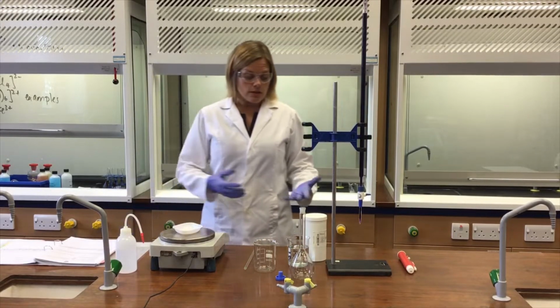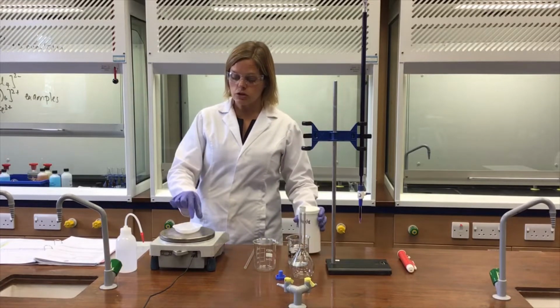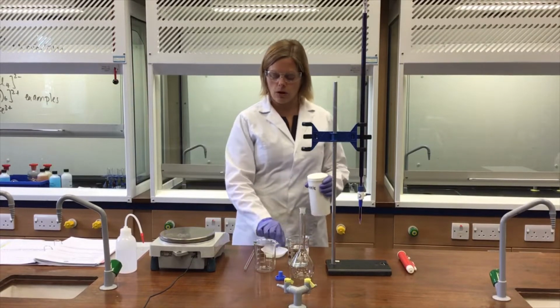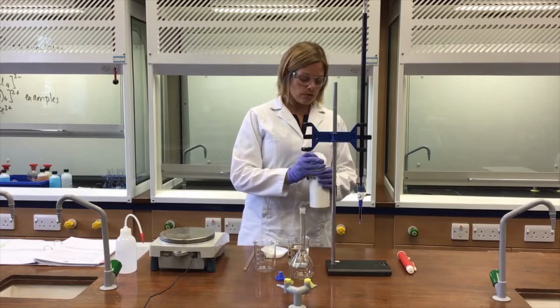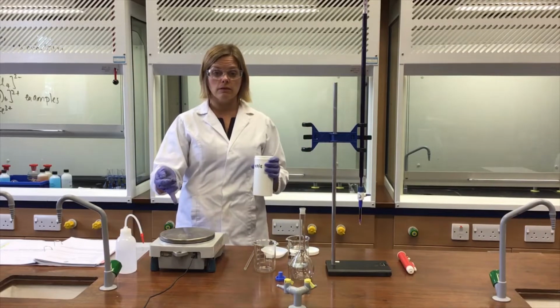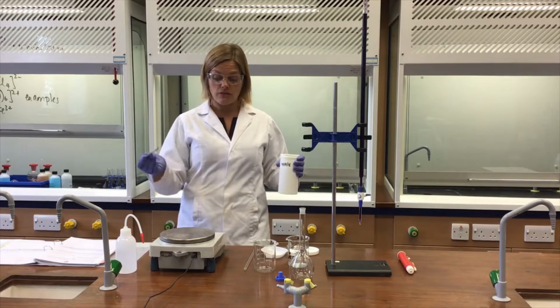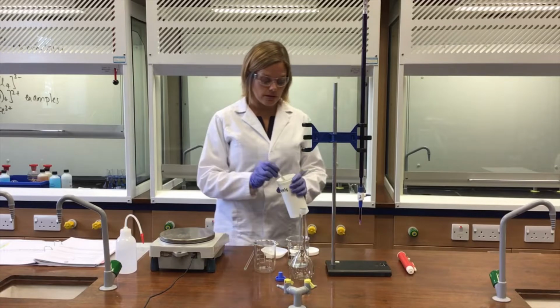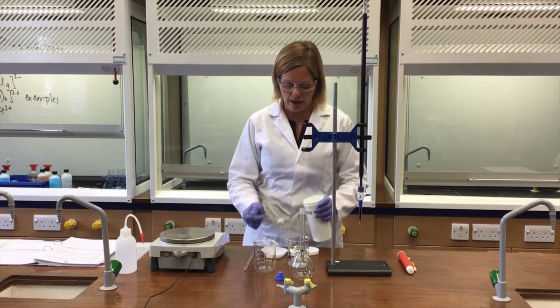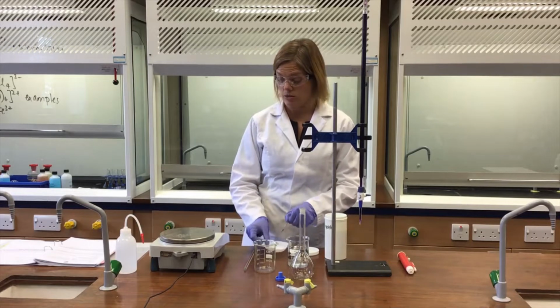Then I need to add some solid to it. The method says between 9.5 and 10.5 grams. So the first thing to do is to remove the weighing boat from the top of the balance. That's important because if I spill any of this compound on the top of the balance, it would get weighed alongside the solid being transferred, but it actually would never be transferred. So that would increase the procedural error massively. And in fact, that's not really a procedural error, it's just a mistake, it's just poor practice.